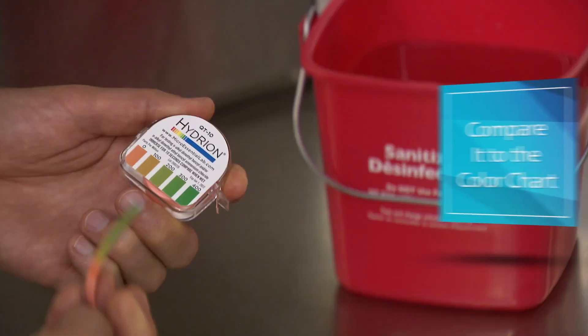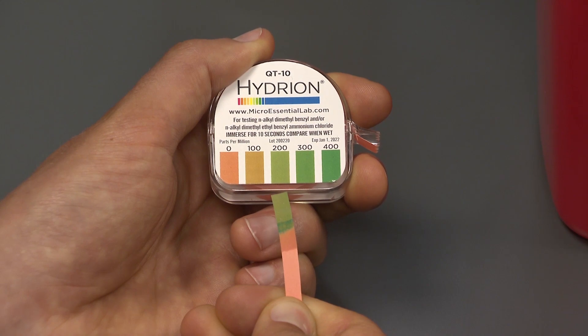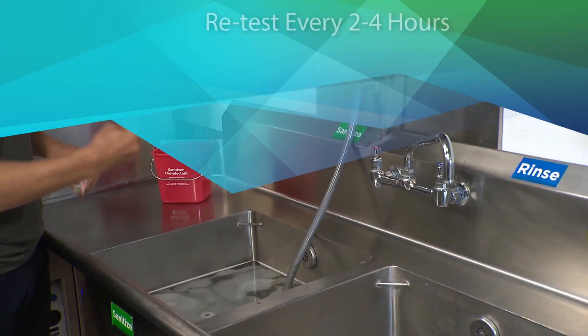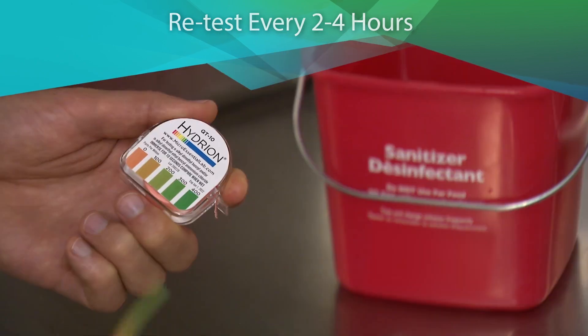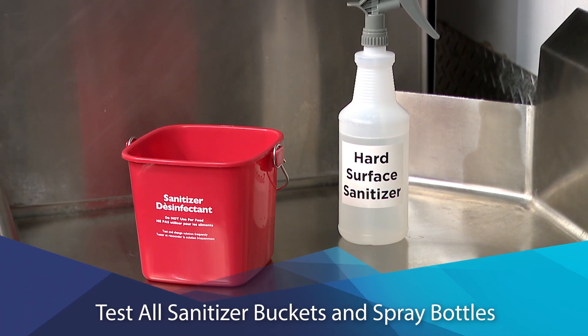Hold it steady for ten seconds, then remove it and compare it to the kit's color chart. If there are darker bands, use the dominant color for matching. Be sure to retest every two to four hours. You may need to adjust the solution if repeated tests don't meet your target. Be sure to test all sanitizer buckets and spray bottles too.